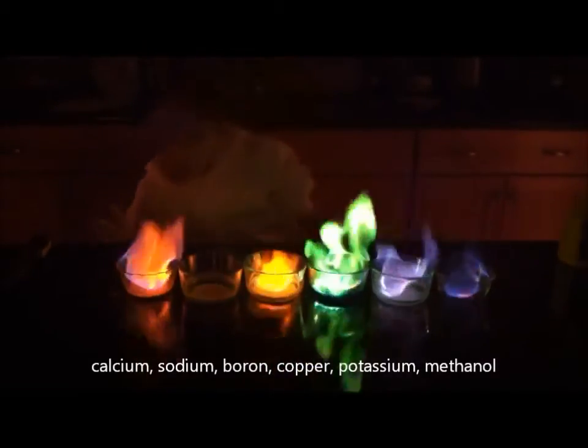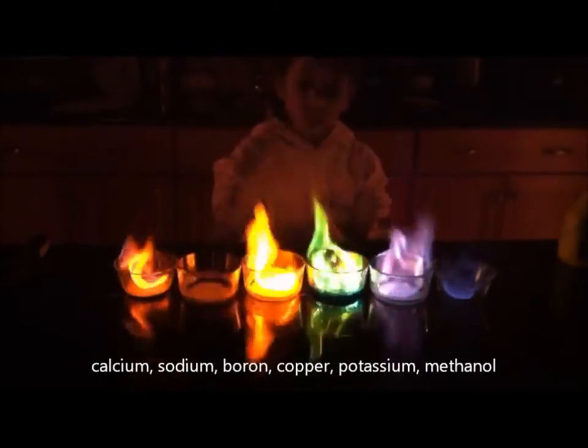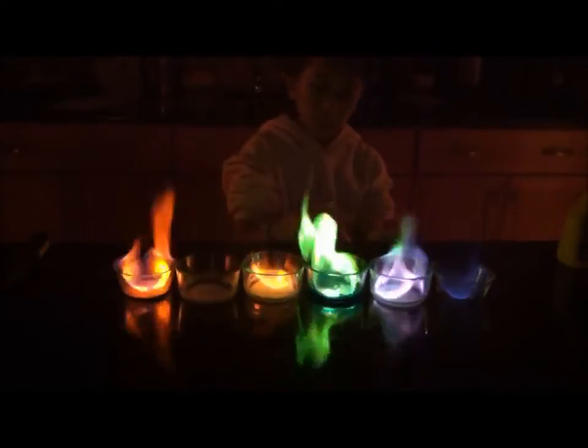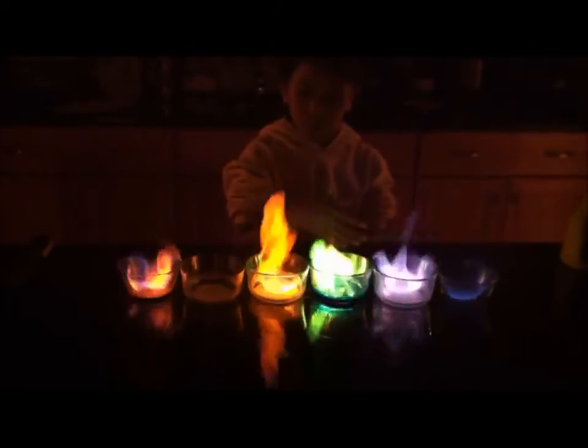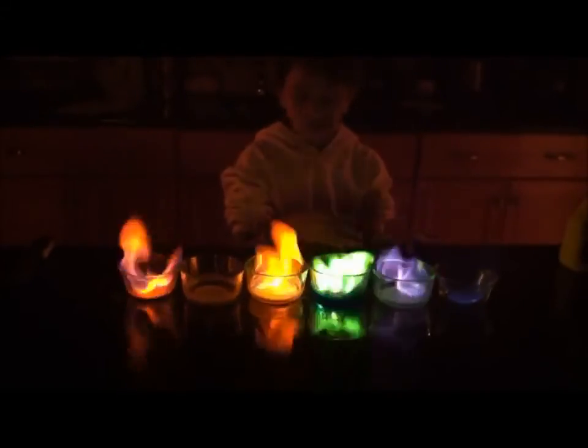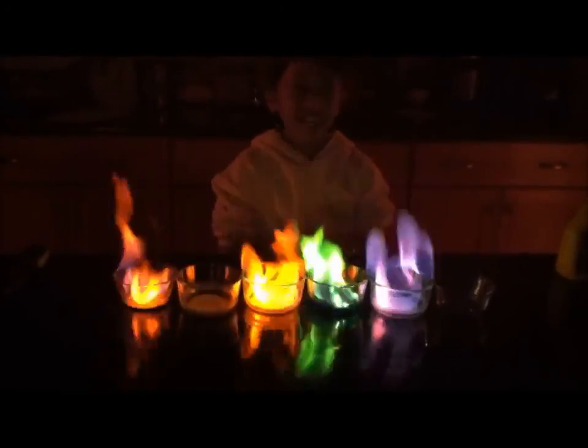It looks red through the screen — orange, red, orange, yellow to green, purple. Look at the pretty purple! And then just plain heat blurring this blue.